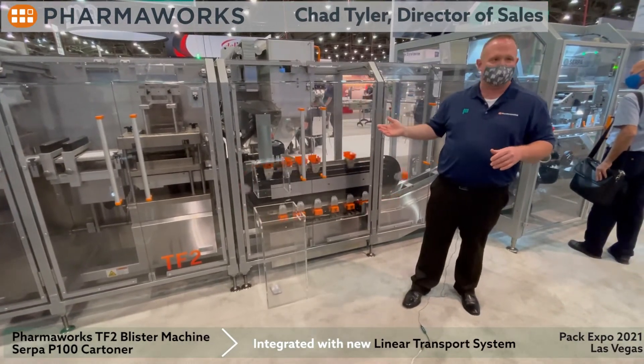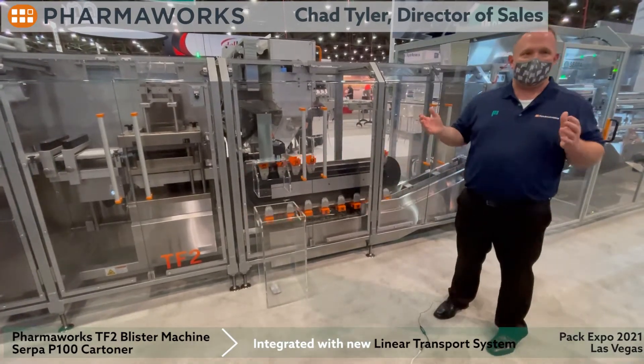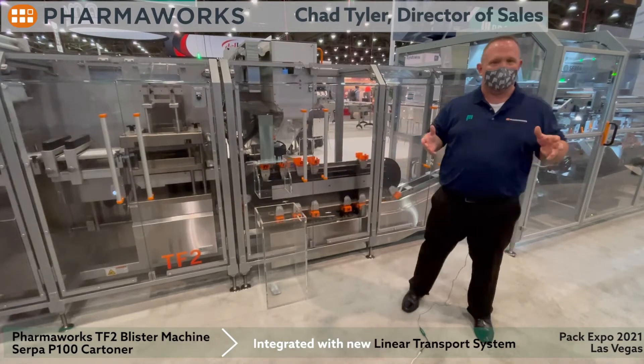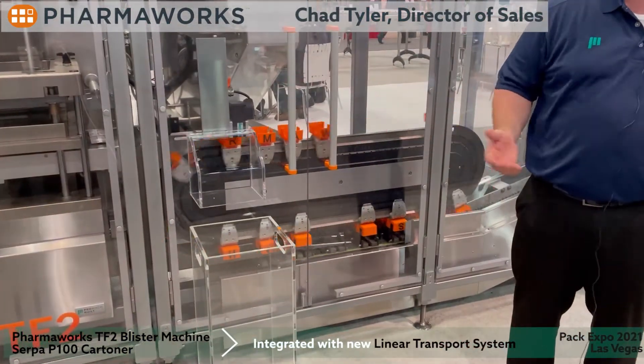We have a nice rejection system on here as well. But what I'd really like to talk about is we have two asynchronous machines that we're going to synchronize up with the Beckhoff linear transport, often referred to as the XTS.